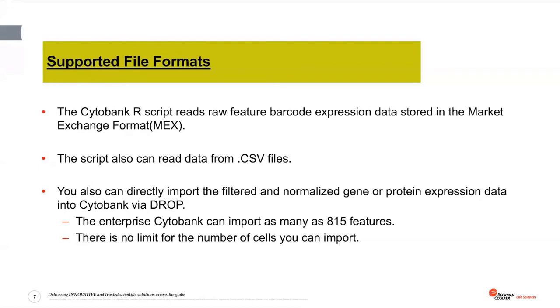And then after PCA, you can select maybe the first 20 principal components, use those as features, and import those features into Cytobank for your downstream analysis. And I also would like to mention there's no limit for the number of cells you can import, regardless of whether you are an enterprise or premium Cytobank user.